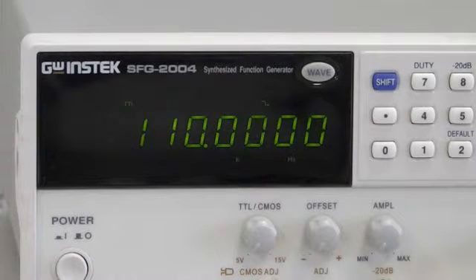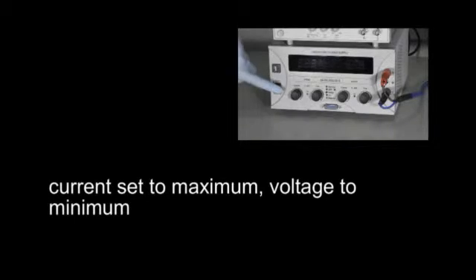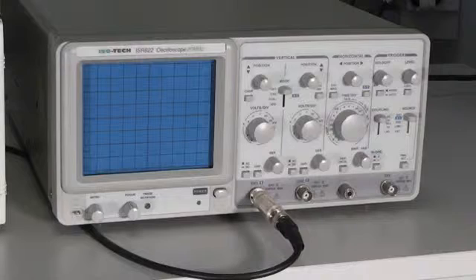If you want to test your sample at 110 kHz with 25 millitesla, switch on the function generator first and input 110 kHz. Make sure the current is set to its maximum and voltage is set to its minimum in the DC power supply. Now switch on the DC power supply, coil enclosure and the oscilloscope.